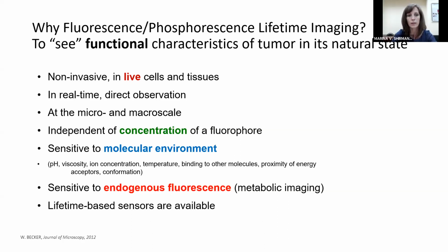Fluorescence lifetime is also very sensitive to endogenous autofluorescence of tissue, which originates from metabolic molecules, metabolic cofactors. This is maybe one of my favorite topics today, because this is a label-free approach, closer to the clinic.